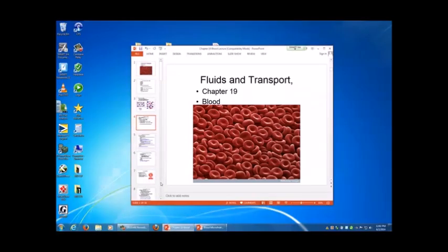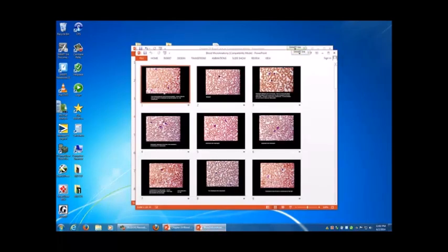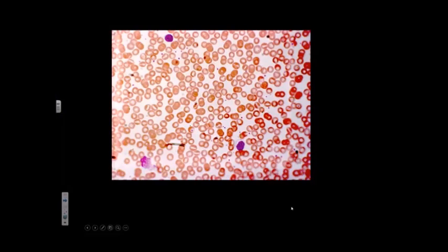So, since we've done that, let's pull up this right here. Okay, these are pictures I took a long time ago. Okay? So, keep referring to the images in the lecture handout. Those images we just went over together.